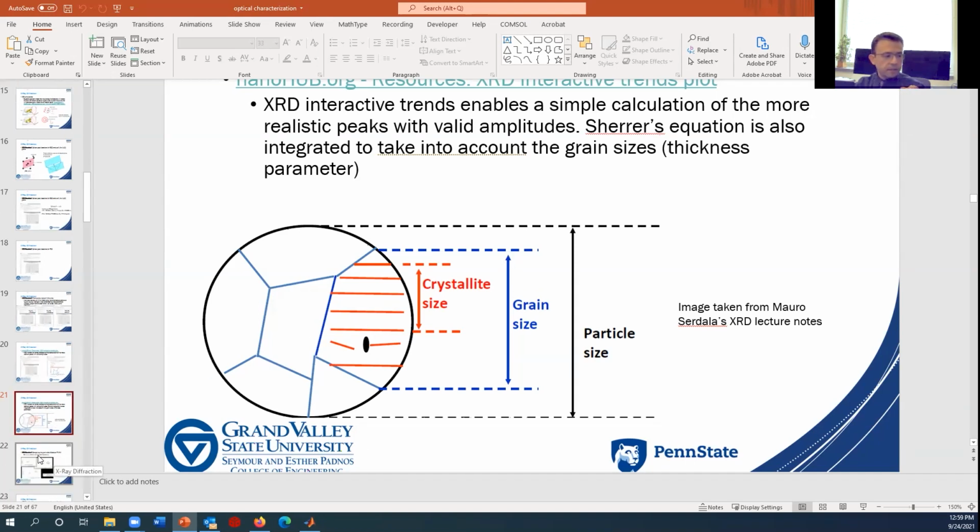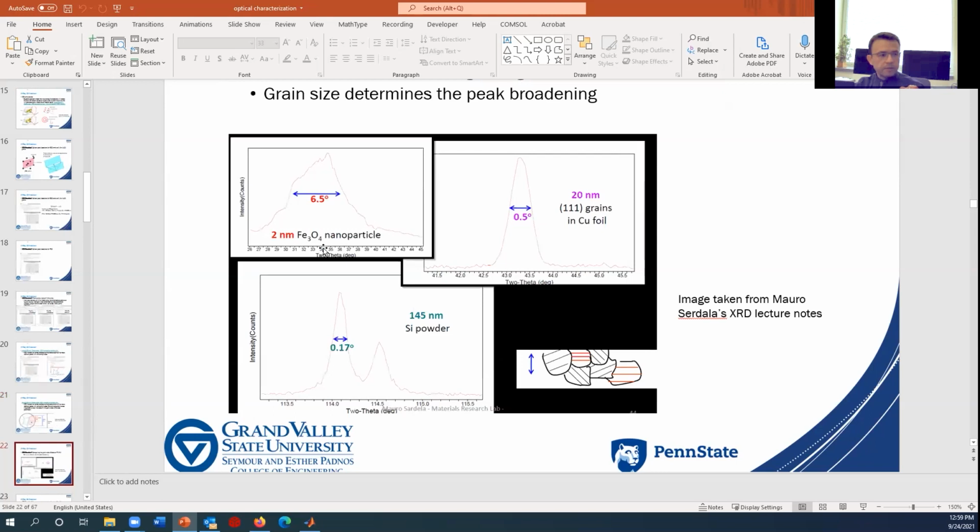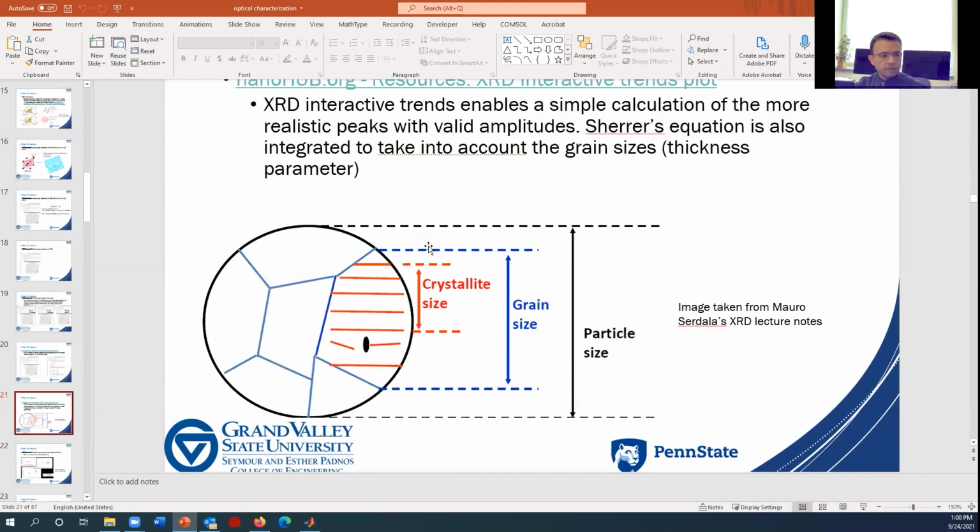The students can understand that, because if you look at the examination under XRD with the nanoparticles, those peaks that we were used to seeing as very sharp peaks are going to be broadening up because of the fact that these are getting very close to each other.